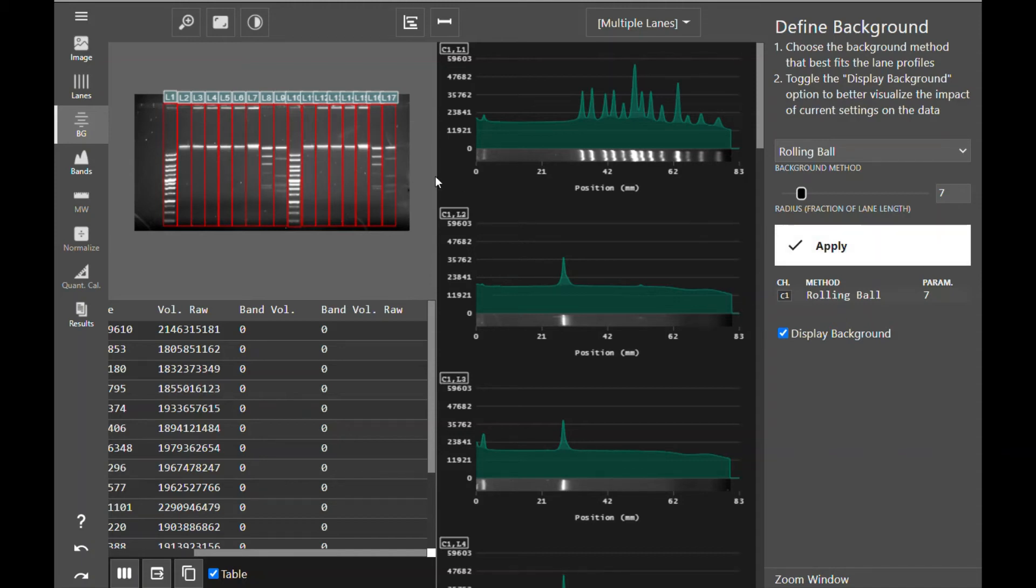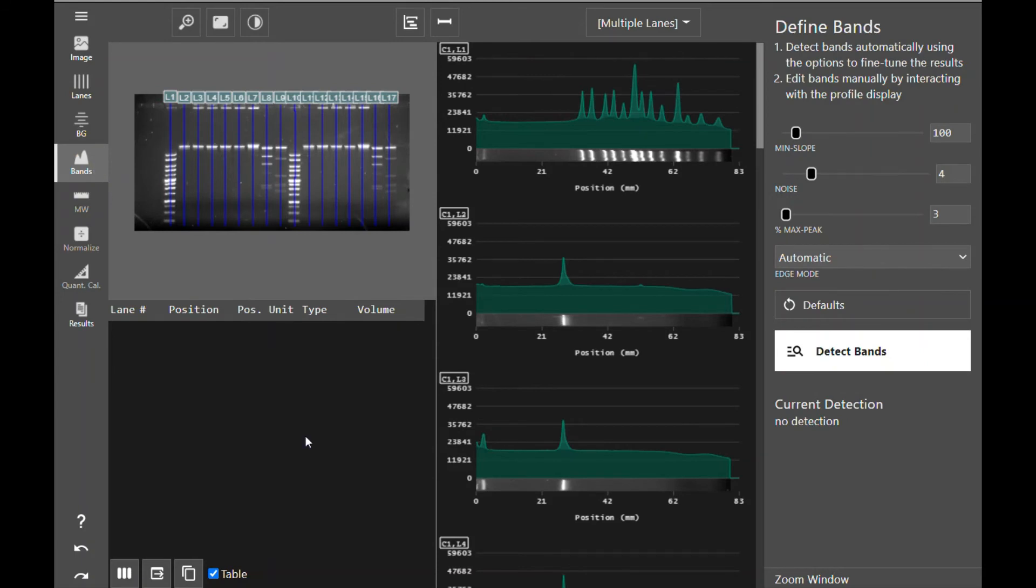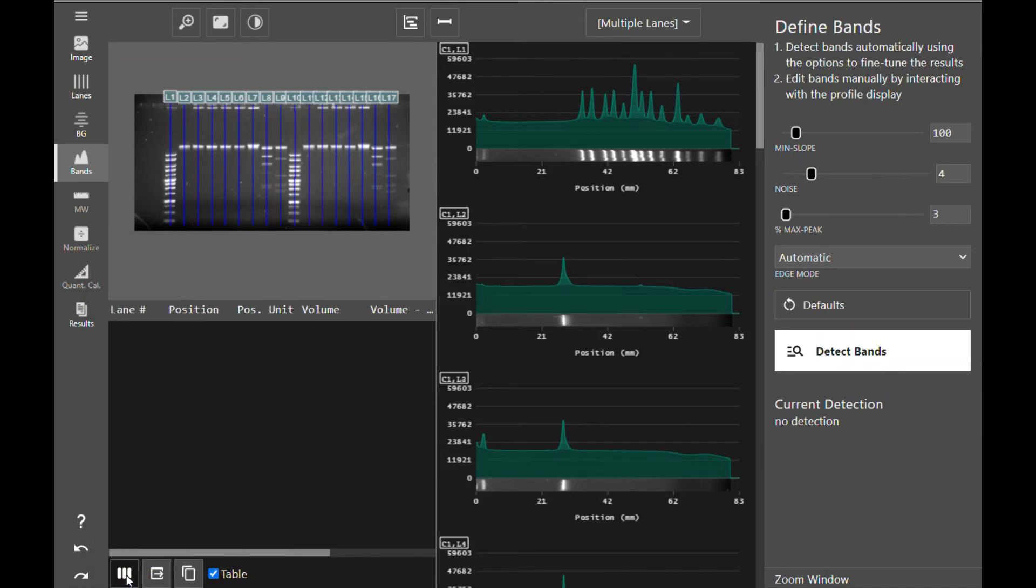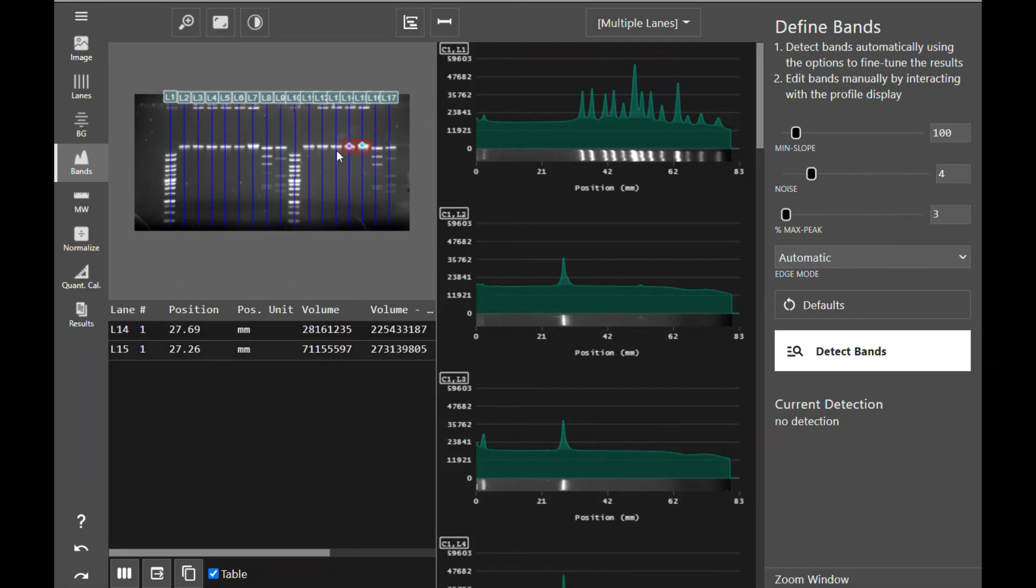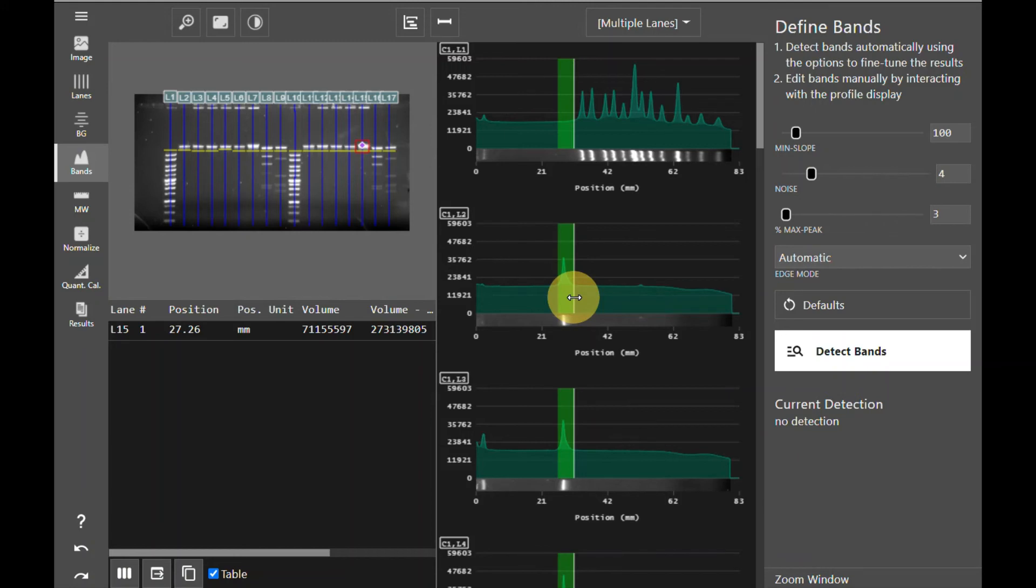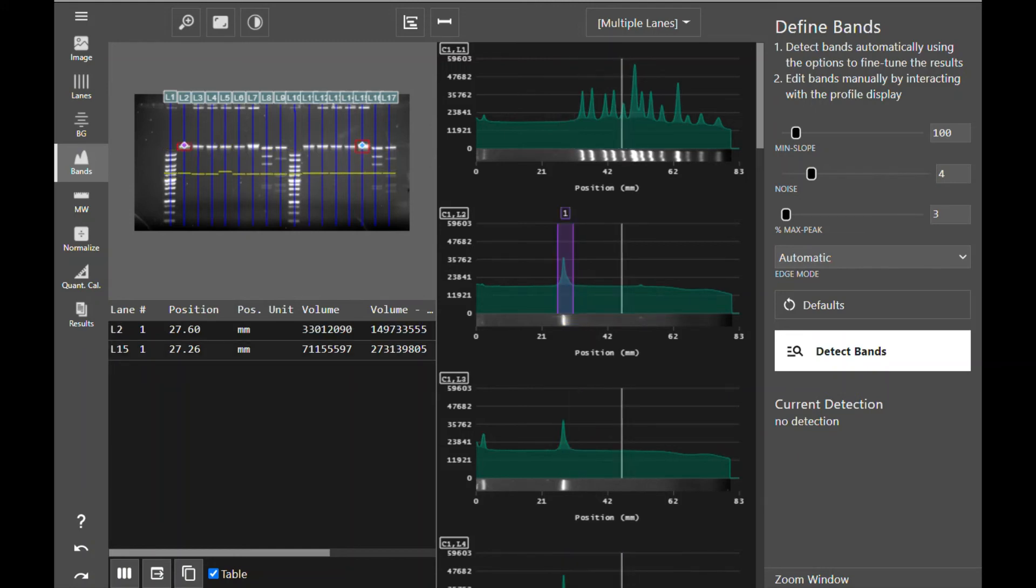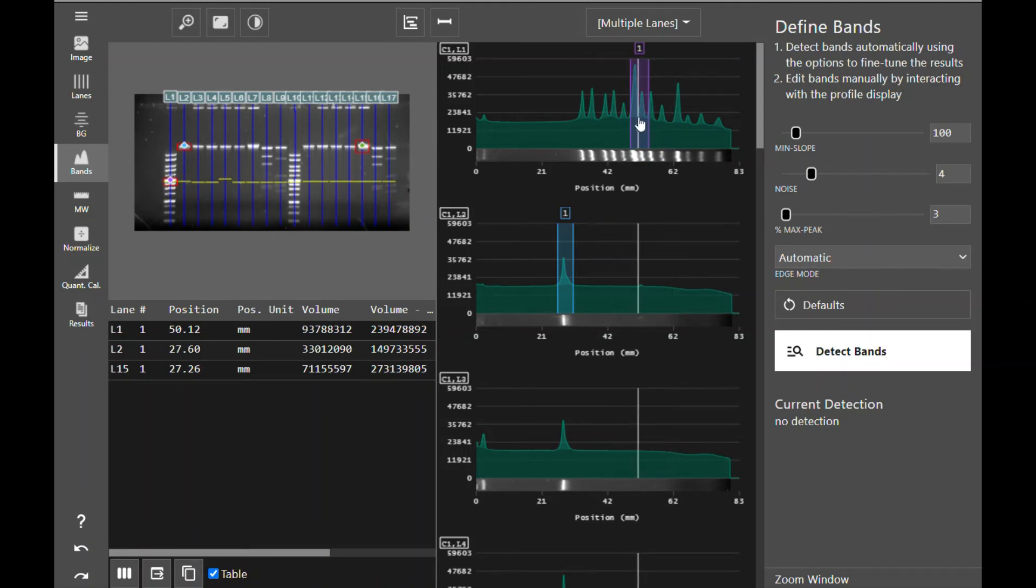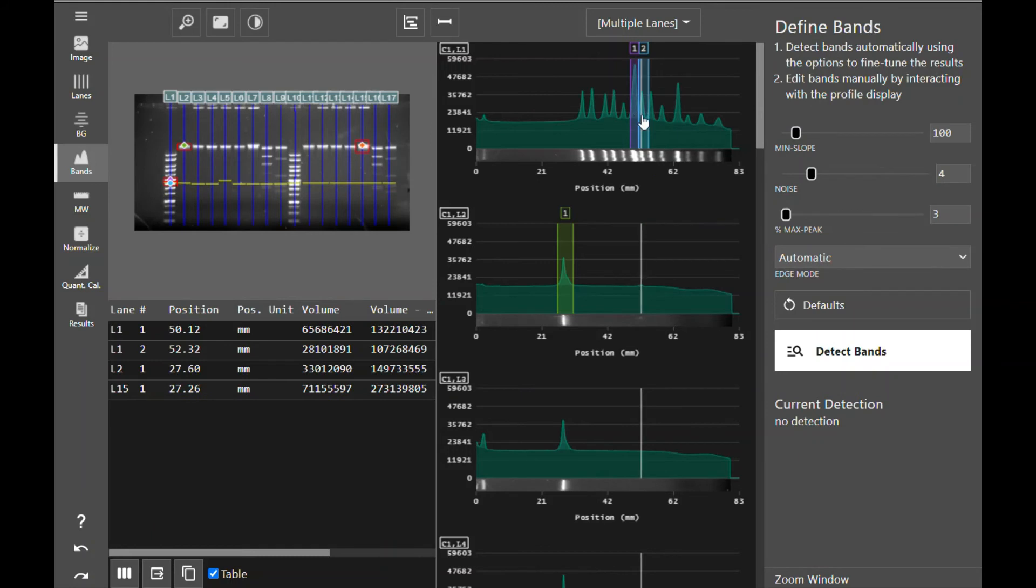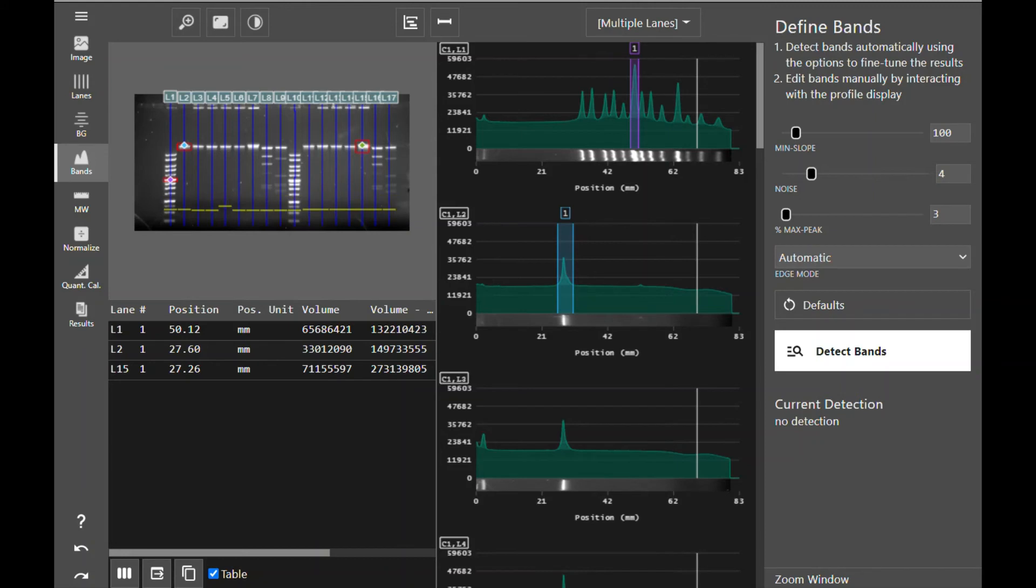Once you have chosen your background subtraction method and subtracted your background, it is now time to move on to bands. Once you have entered the band definition tool, you'll again see the data table displayed on the bottom left corner. You can click to select what columns you would like displayed. And the data for each band will appear once you have detected bands. Azure Spot Pro gives you several methods of detecting bands. You can go directly to the image and left-click on a band to detect it. You can also right-click to delete it. You can go into the image profiles and click and drag lane boxes to detect bands. And you can also right-click on a spot to split a band box or right-click to delete bands.